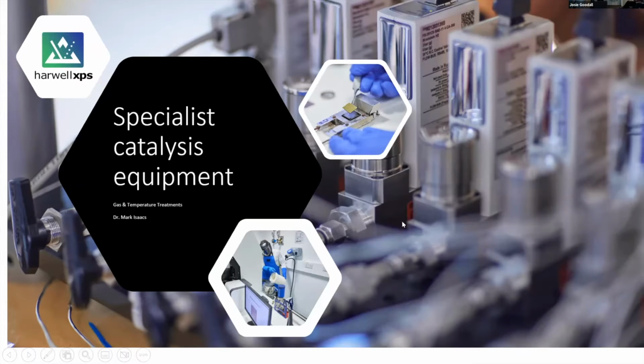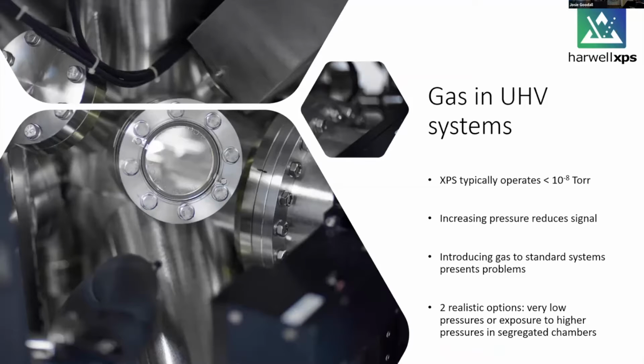But now we're going to have a look at some of the specialist equipment we've got available in other places, in terms of the systems and the gas environments and the different temperatures. Not ambient pressure, that's going to be covered later, just gases in UHV-based systems.